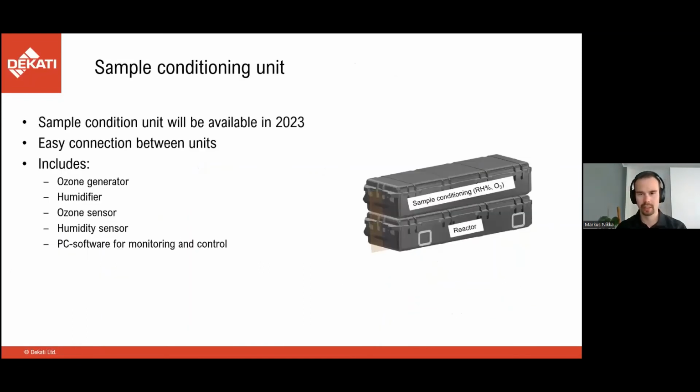And the last thing I want to introduce is the sample conditioning unit that is under development at the moment and will be available in 2023, so next year.